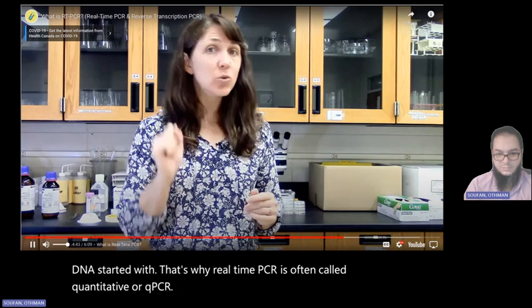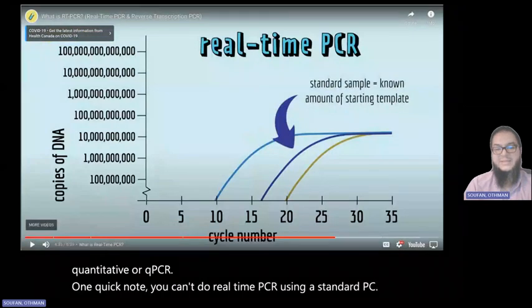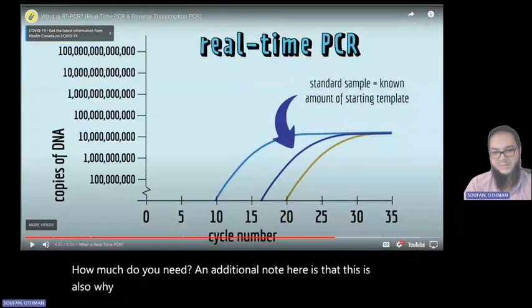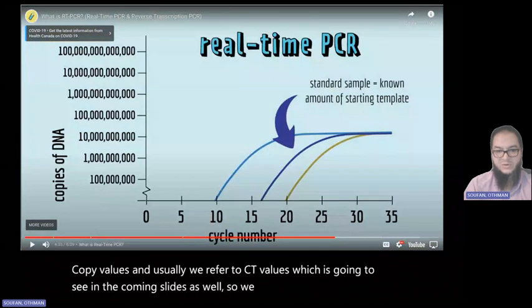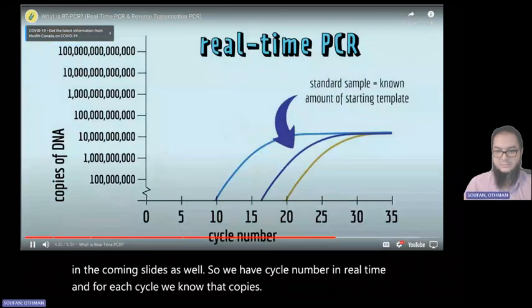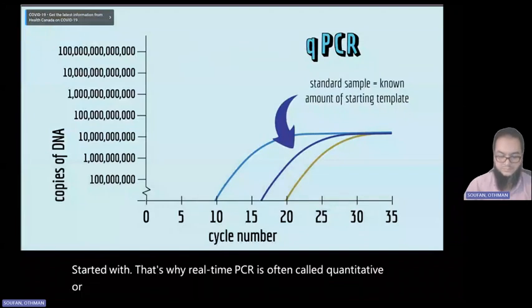One quick note, you can't do real-time PCR using a standard PCR. An additional note here is that this is also why in real-time PCR, it is typical to see curves that we deal with. Copy values, and usually we refer to CT values, which we're going to see in the coming slides as well. So we have cycle number in real time, and for each cycle we know the copies we started with. That's why real-time PCR is often called quantitative or qPCR.